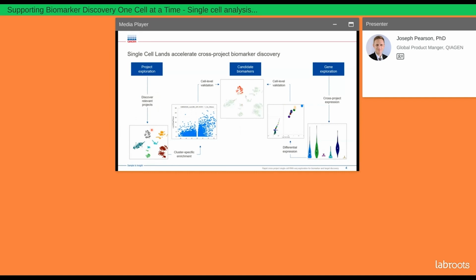As part of our curation process, we perform pre-computed comparisons between each cluster and all other clusters within the dimension reduction plots. And so you can explore these differential expression results to identify the top upregulated genes within each of those clusters. And then you can directly explore the expression of those at the cellular level on dimension reduction plots with gene expression overlays.